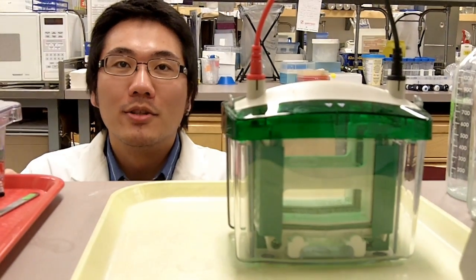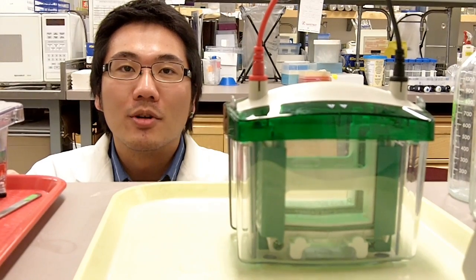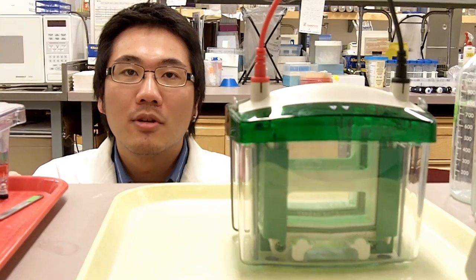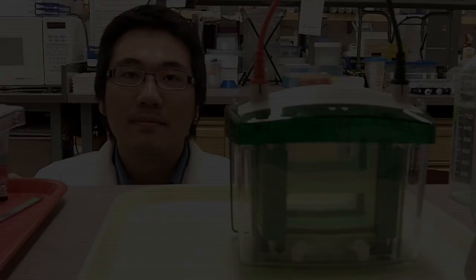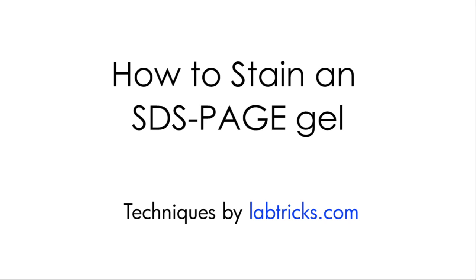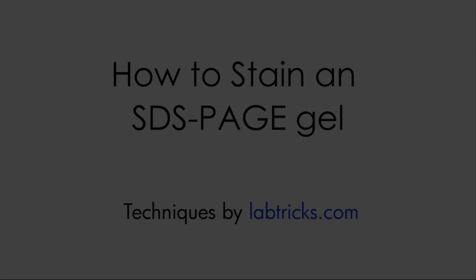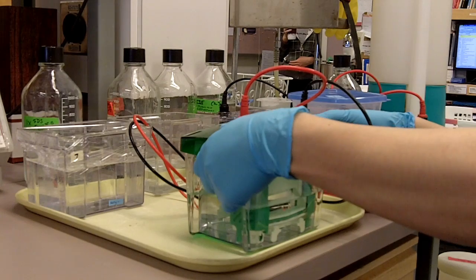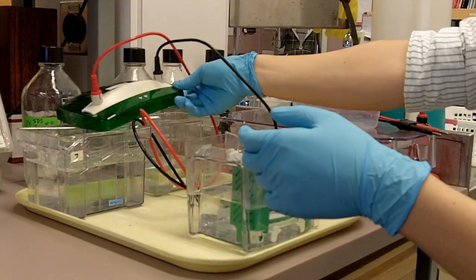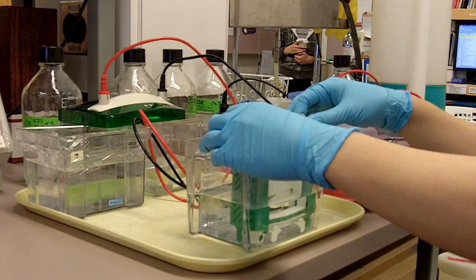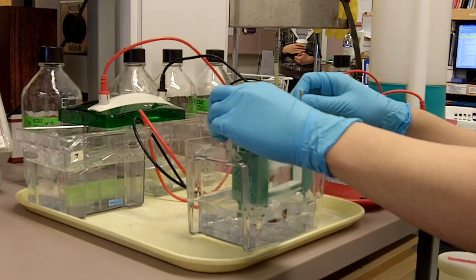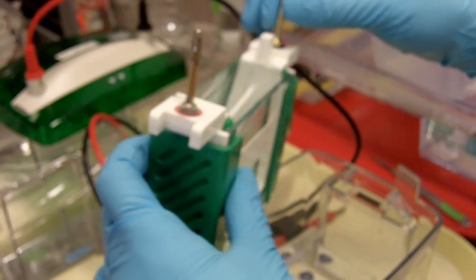So your gel has just finished running, what do you do next? Today I'm going to show you how to disassemble and stain your SDS-PAGE gel using either Page Blue, Coomassie, or silver staining. After you unplug your electrode and remove the lid, take out the inside chamber and carefully pull out the buffer.